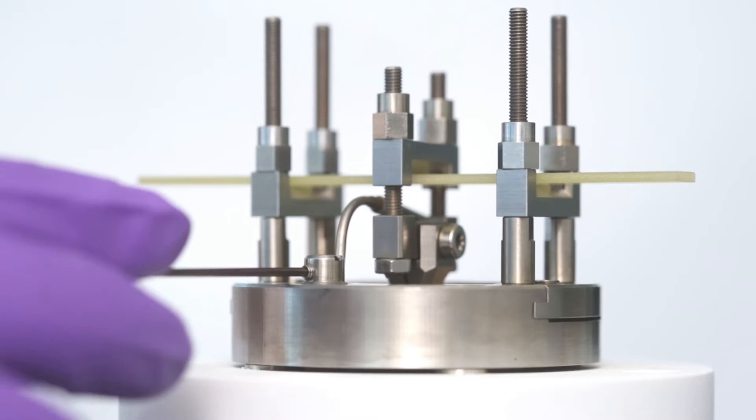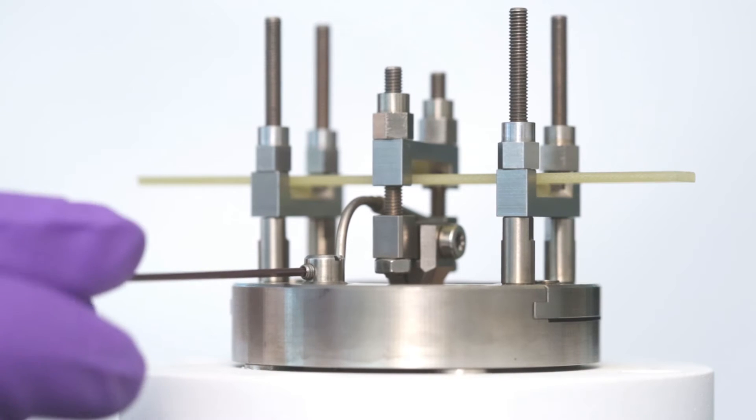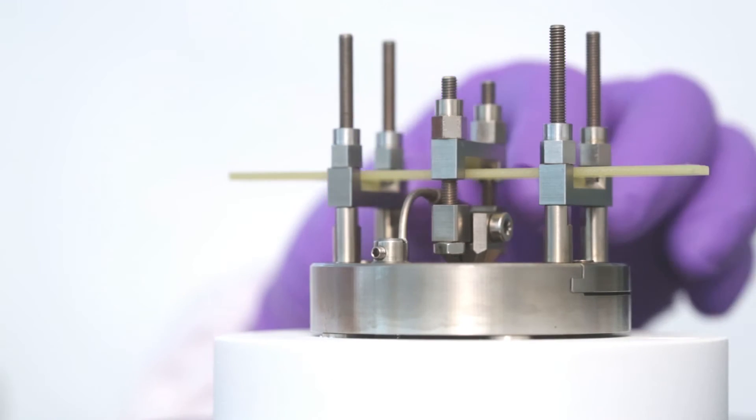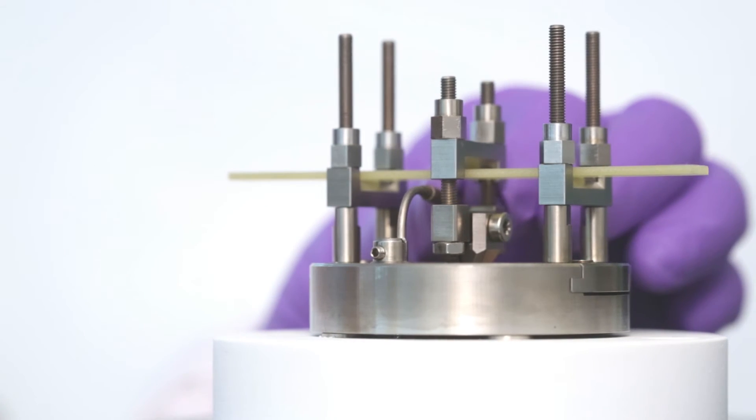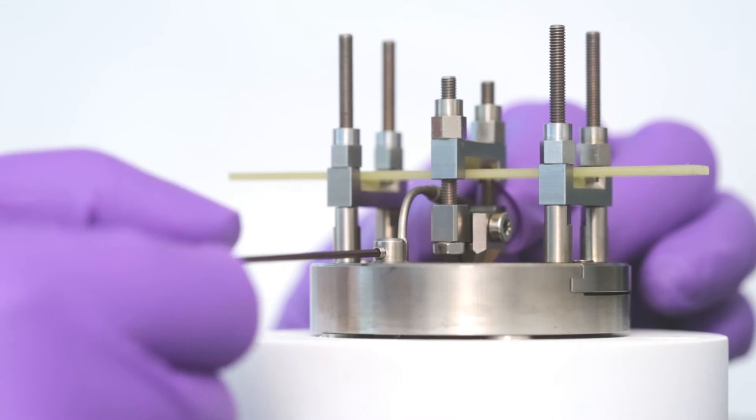Once the force has been applied, loosen the securing screw of the temperature sensor with a 1.27 mm Allen key. Position the temperature sensor as close as possible to the sample without touching it. Then, tighten the securing screw.